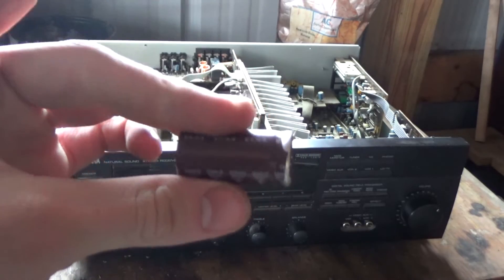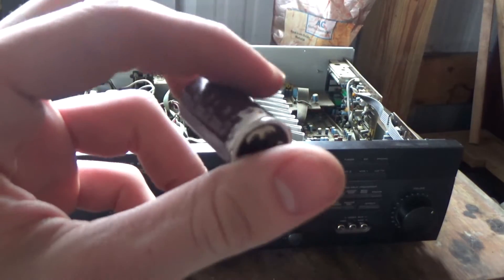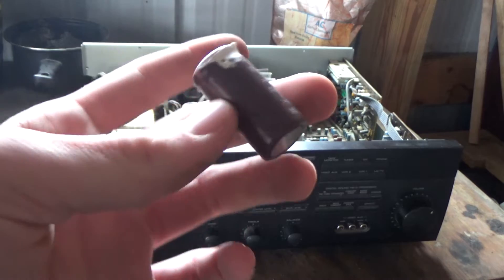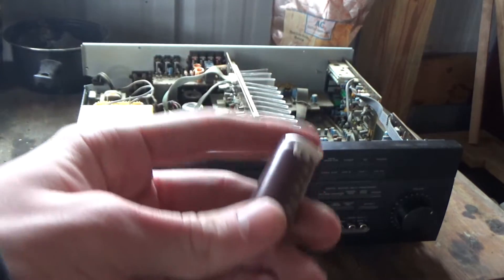If you want to do this yourself, the first thing you're going to want to do is put some gloves on, because the electrolyte they use in these capacitors will stain your hands yellow pretty bad. I don't know how bad that is for you, but I'm assuming it's not good — so wear gloves.